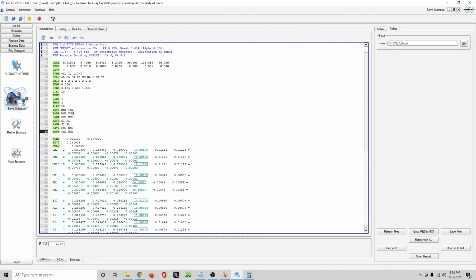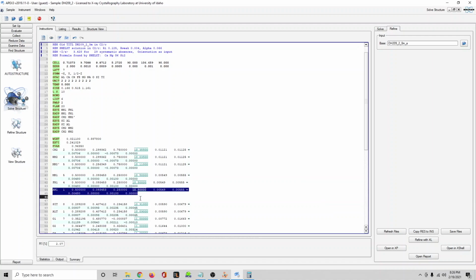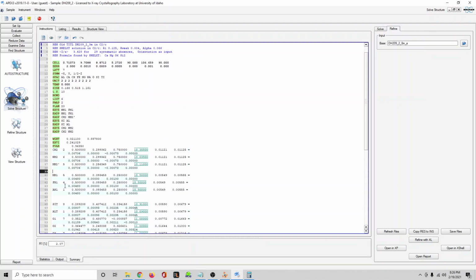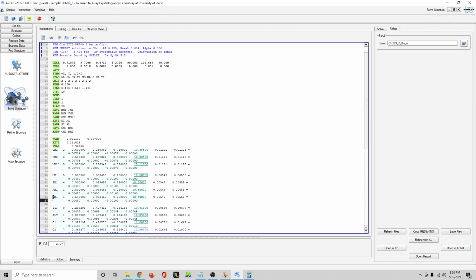These two I'm going to have to expand to, all right, well, we have to put in the other stuff first. So we've got aluminum. Aluminum, we need chromium still. CR. Well, we'll just label it R. I don't know. Why not? And 1, 2, 3. I hope this is all right.